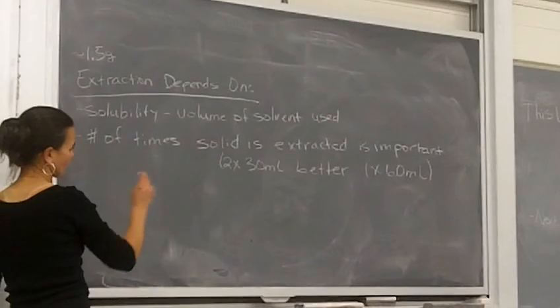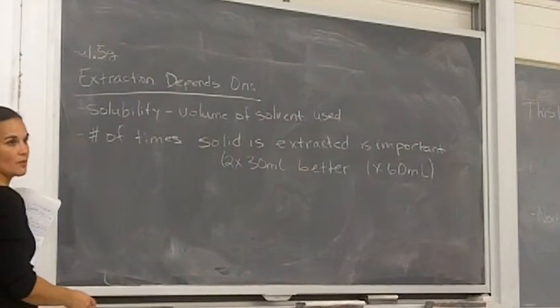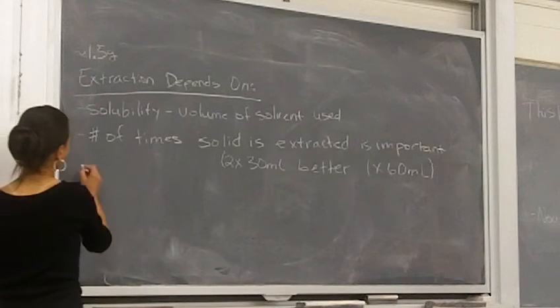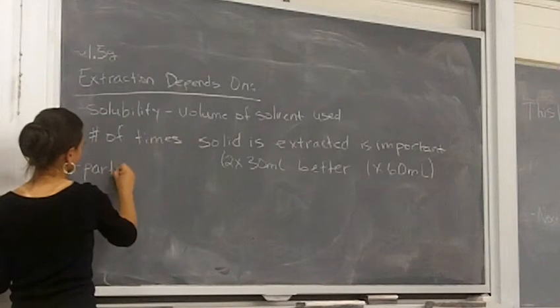So whenever you're doing an extraction like this, you would always want to do things more than once, all right? Particle size is something else that's important.